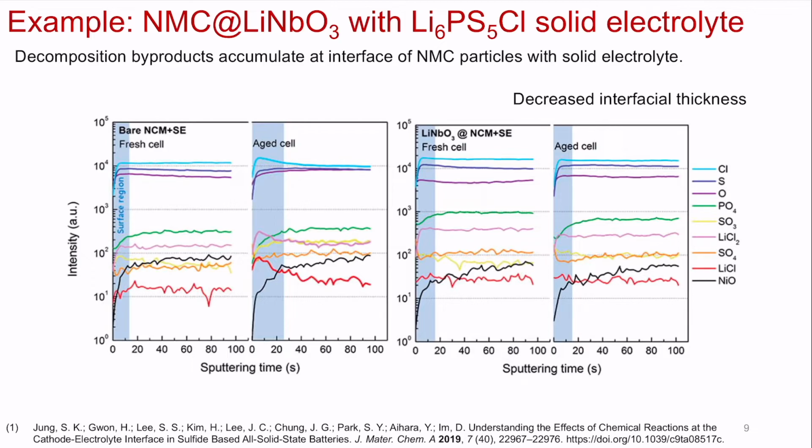Okay, so I should say SIMS is a very sensitive measurement. So, okay, you're saying this quantity is a little bit lower than the saturation point after the same amount of time for the aged but uncoated. Okay.